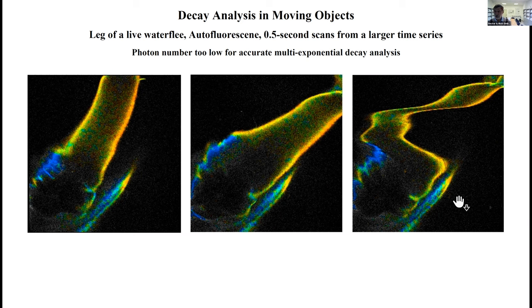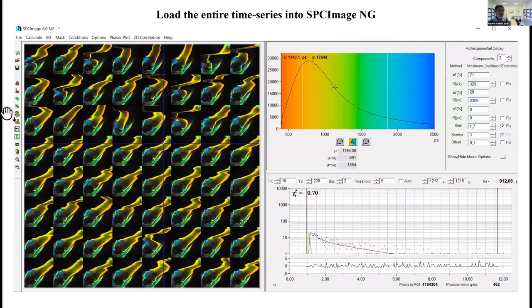Because we recorded only for 0.5 seconds, the photon number is terribly low. You see this kind of image contains a lot of noise. Okay, combination with the phasor plot. We load all the little images from the entire time series into SPCImage.